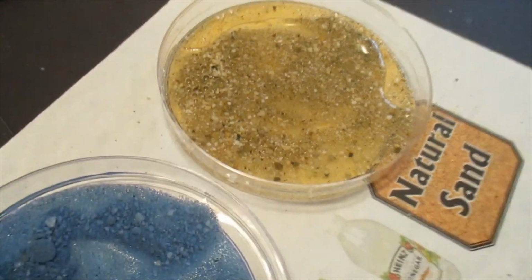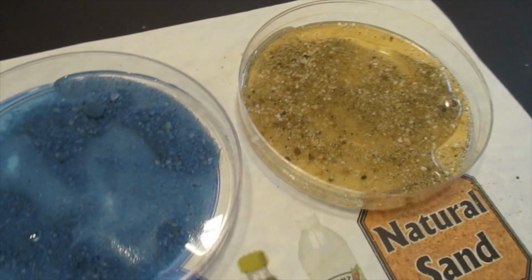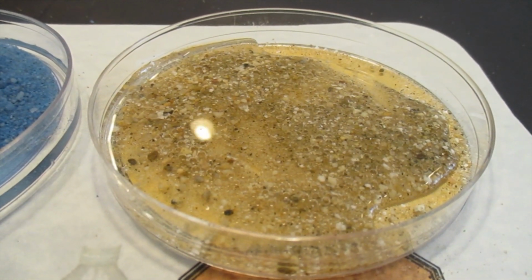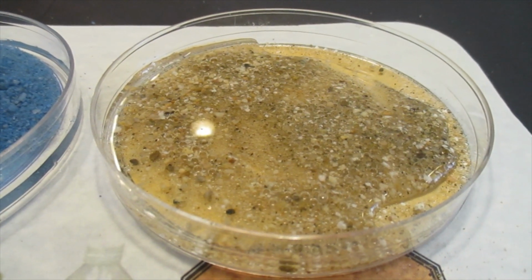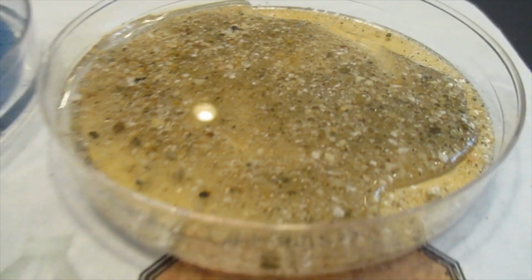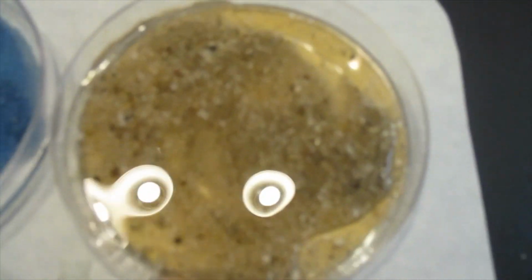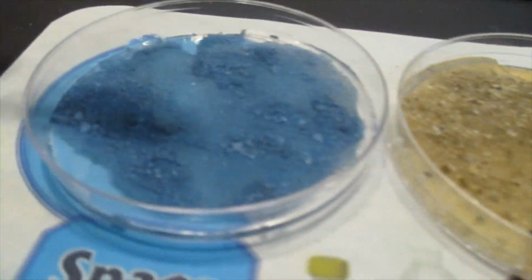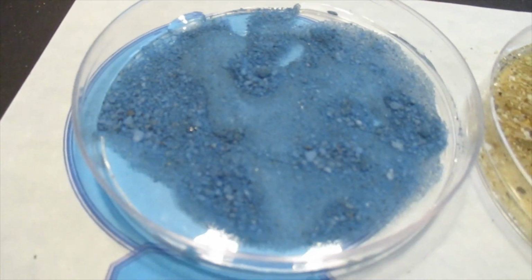Ian, could you move them for a moment? I'm trying to see if there's bubbles. Ian, I gotta get right here. Okay, sorry. Okay, so do we see any bubbling? You can see when the surface tension breaks, you can see the reflection on the water changing. You see bubbles in there, Lucy? Yeah, I actually see quite a lot of bubbles. You see a bubble? Yeah, but I popped it. There's a little bead of water, right?